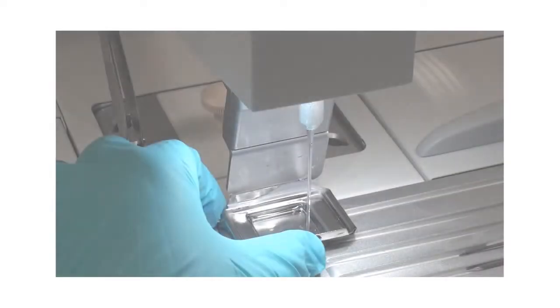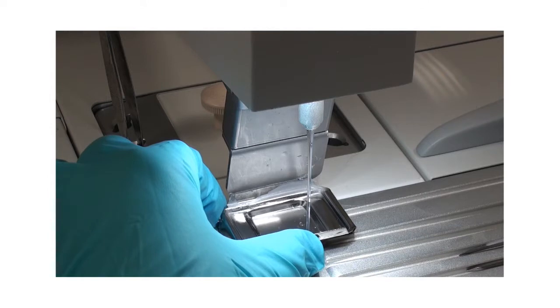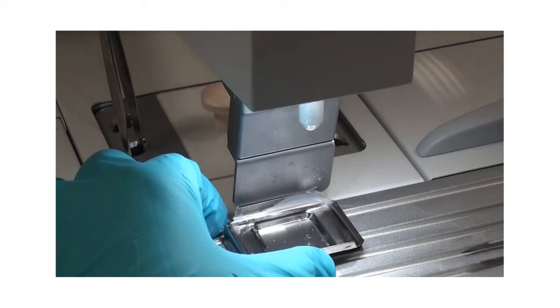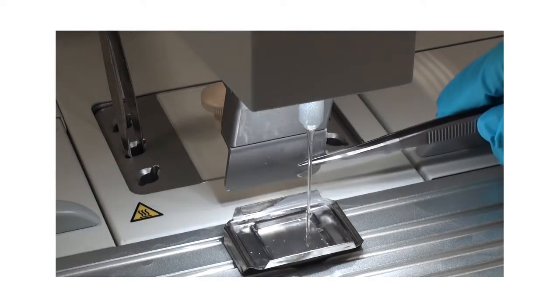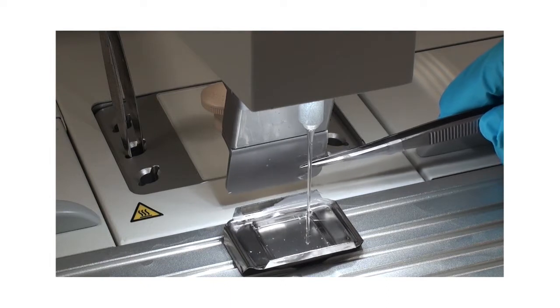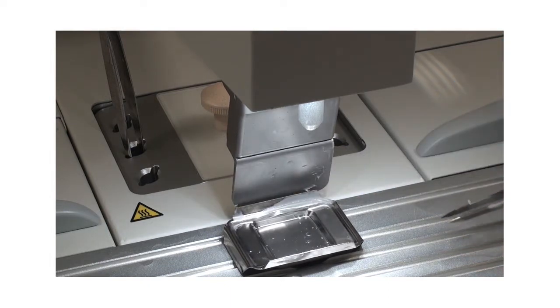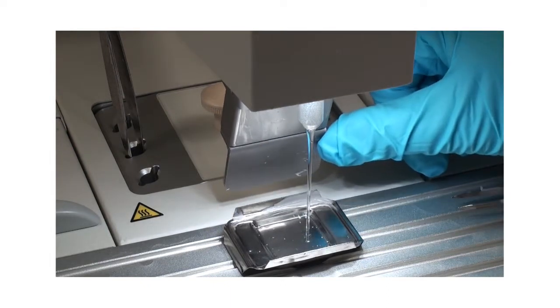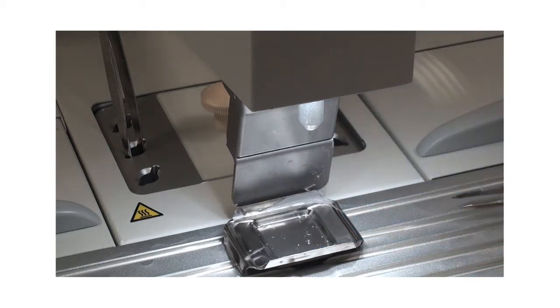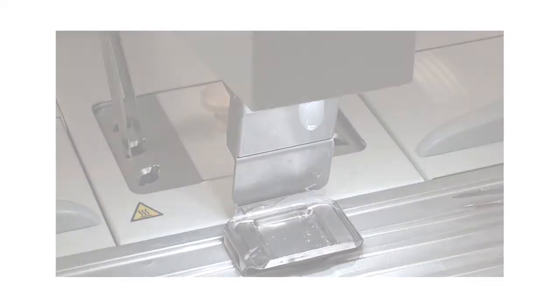When using standard cassettes and or molds, simply push the mold with your forceps, or your finger, against the pressure clip. Pushing the handle backwards will open the dispenser valve. Once released, the handle flips back in the original position and the valve closes.